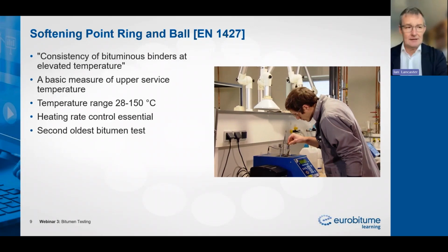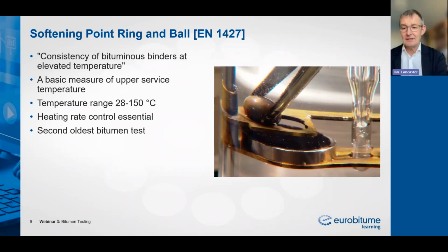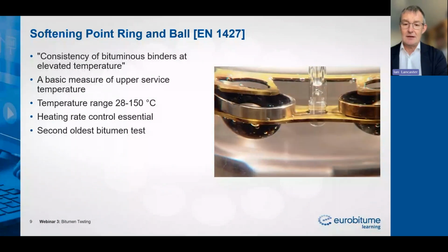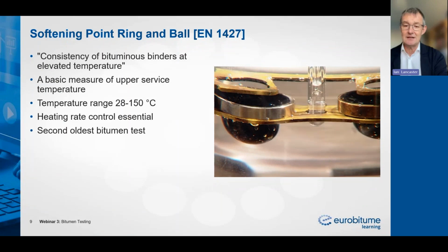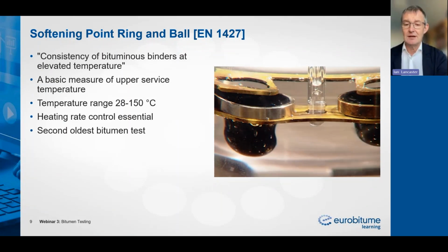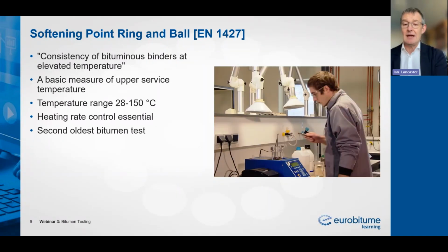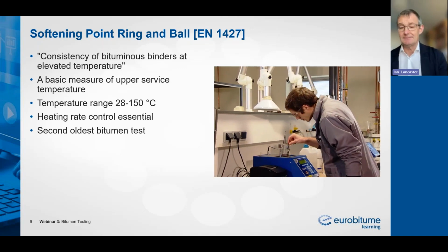Here you can see a technician placing the balls on the center of those bitumen discs. Now this is time lapse, so it doesn't happen quite as quickly as this, but there you can see the bitumen starting to flow, and those two balls drop through and touch the base plate, and that gives us our softening point.